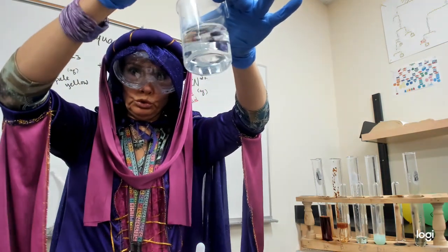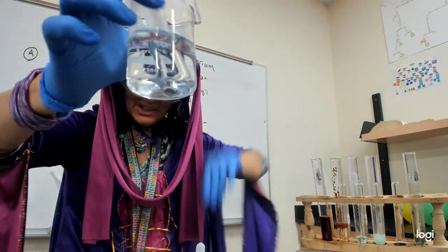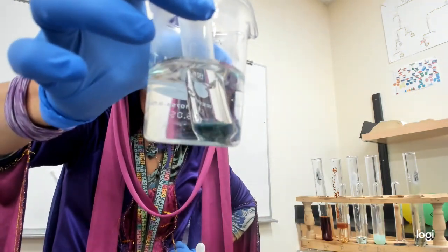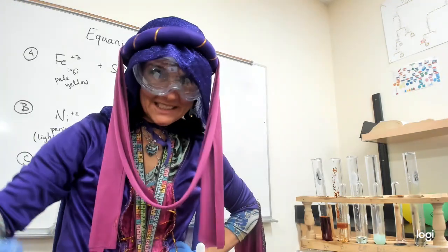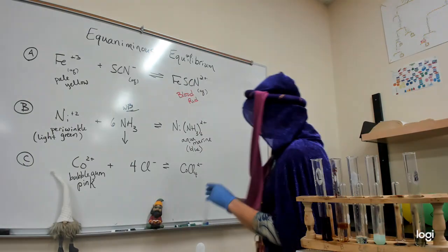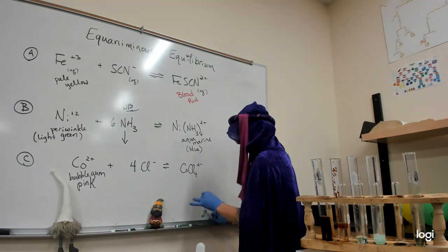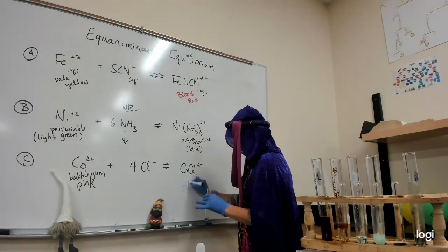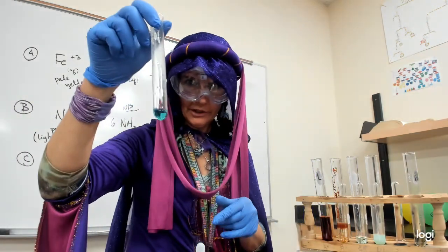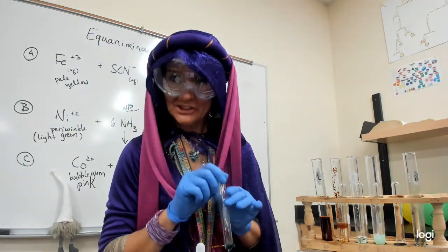It's really hot. Can you see it? It's turning blue. So is it X or N? No. The heat is making it turn the blue. Oh, I lost my pink pen. That's a really pretty blue color. I don't know what color blue that is. Teacher got a little flustered.